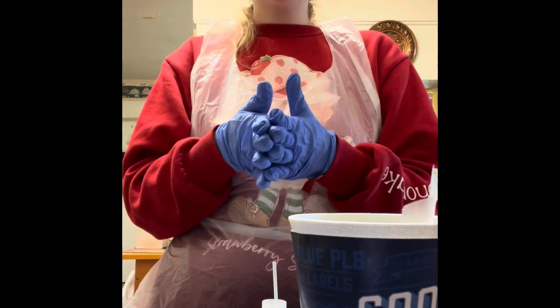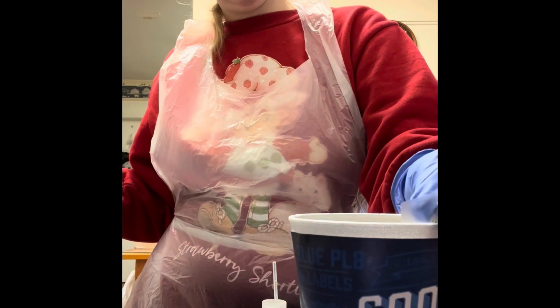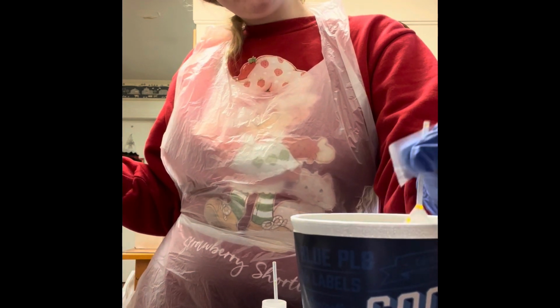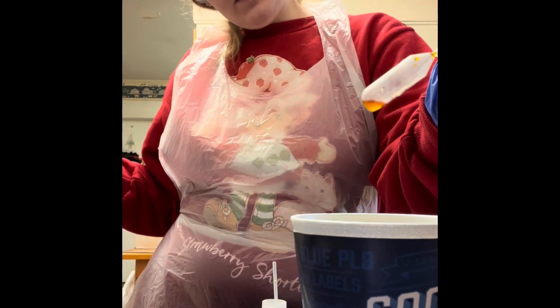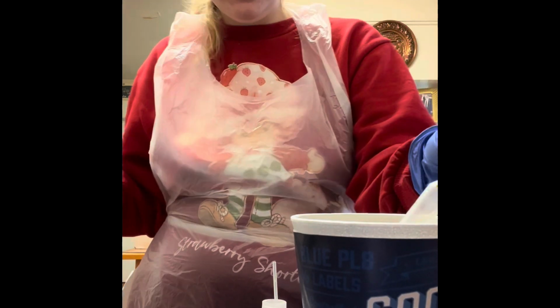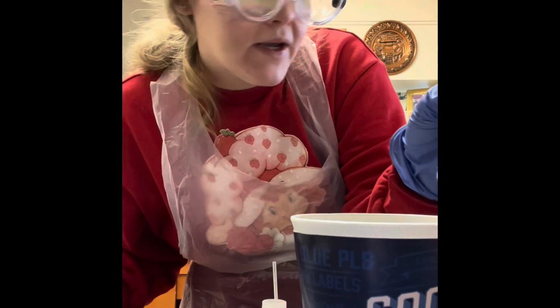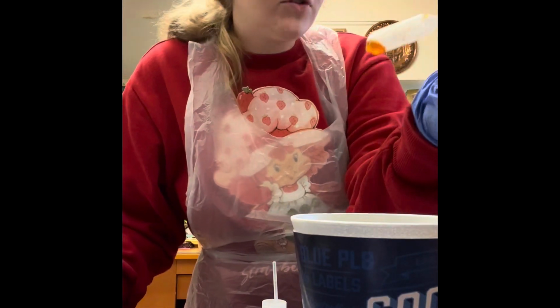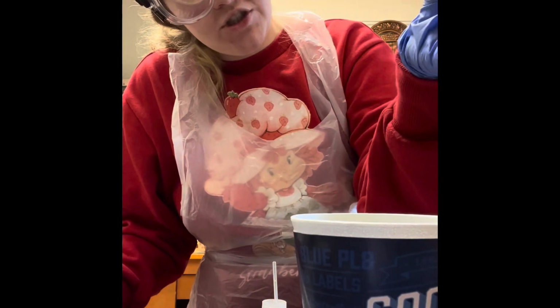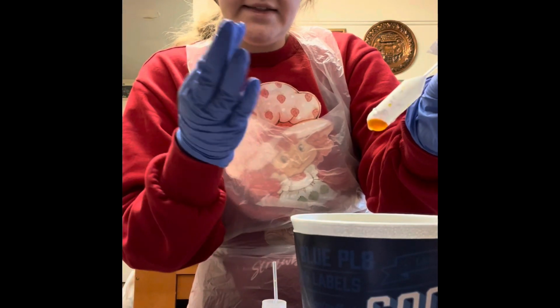Okay, so my 2 minutes are up and it's time to make some observations. I taped my pipette to my cup so that it would stay in there. So it's time to take it out. Oh, it's neon orange. That's so pretty. Okay, it says to swirl it around and it's asking, left or right shift. I'm going to go with a left shift because it looks like it is shifting towards the reactant instead.